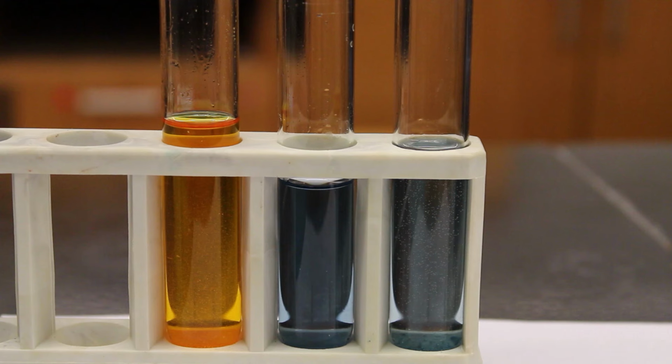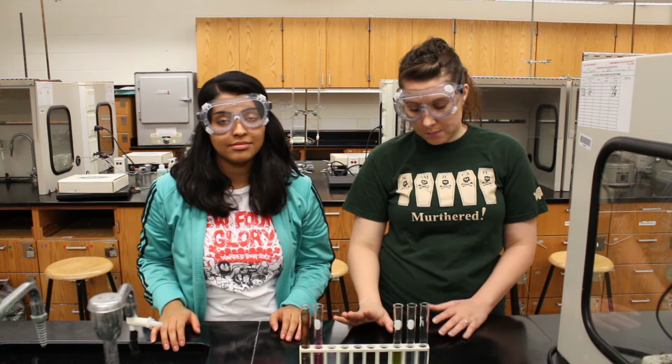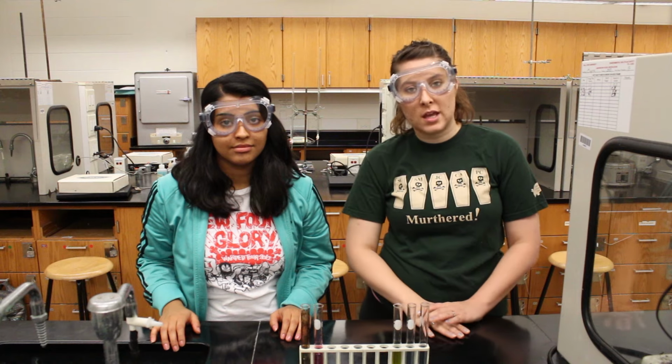Here are the results for your primary, secondary, and tertiary alcohols. Now, you'll be given an unknown to identify in lab today. You'll use this color scheme to find its identity, so be sure to keep it handy.